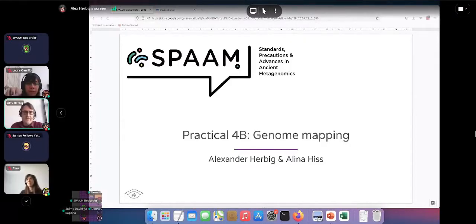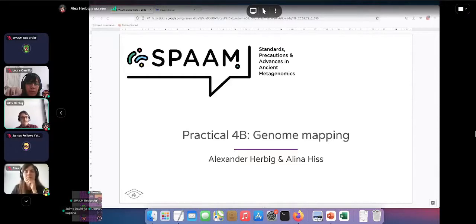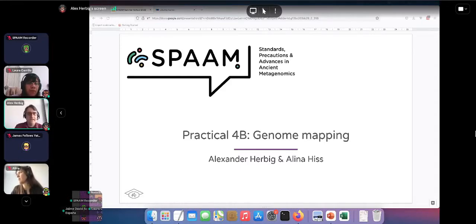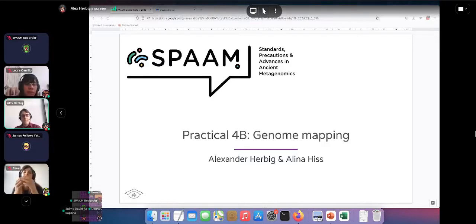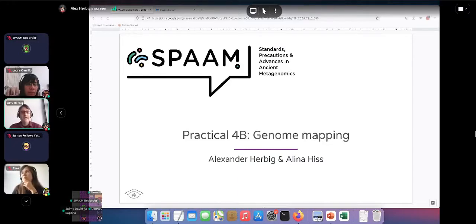What we want to do today is look at genome mapping. As you have already gone through your practical session for EAGER — an NGS processing pipeline specifically targeting ancient genomes, whether human or bacterial — what we want to do now in this practical session is look under the hood at the process usually managed by such NGS pipelines.